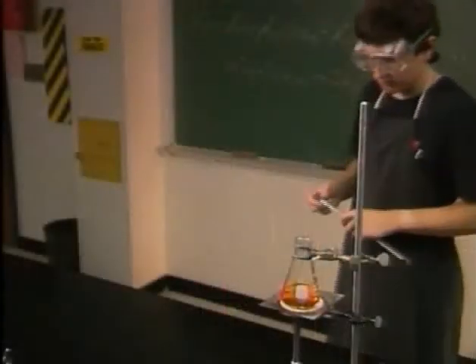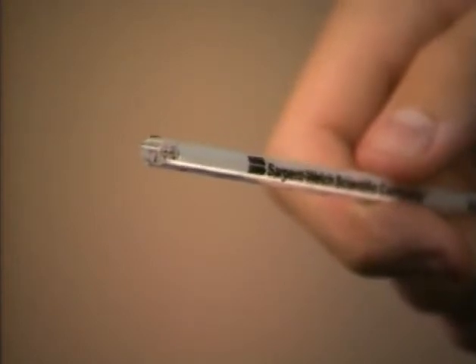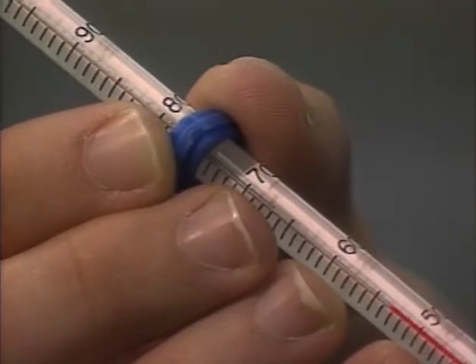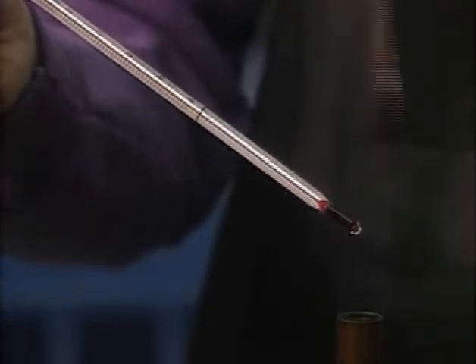Thermometers are one of the most important tools in the chemistry laboratory. They're easy to use, but since they're usually made of glass they have to be handled properly. One common misconception is that lab thermometers have to be shaken down like medical thermometers — shaking is totally unnecessary and it can be dangerous. The liquid inside can move freely up and down on its own without shaking.